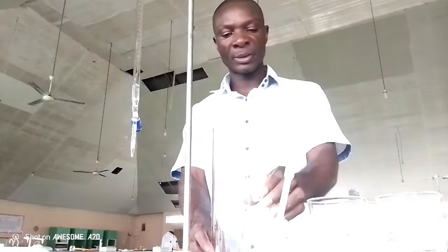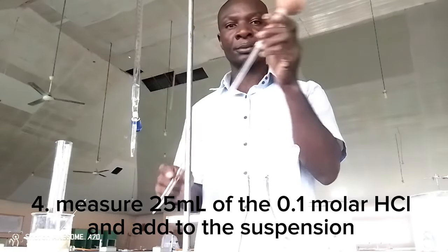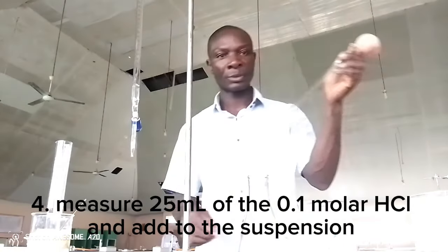4. Measure 25 milliliters of the 0.1 molar HCl and add to the suspension.